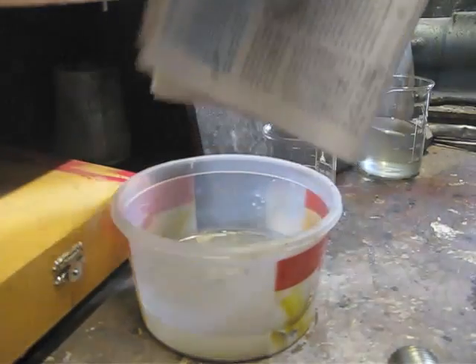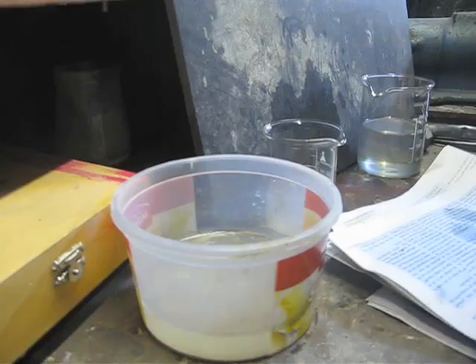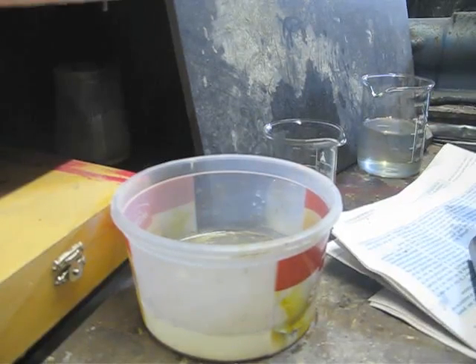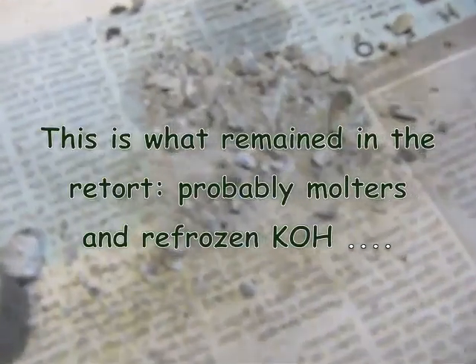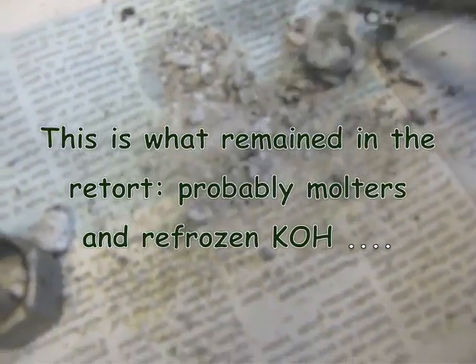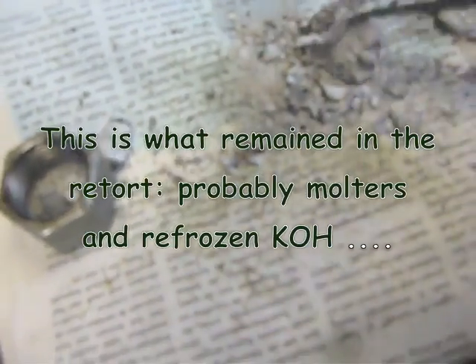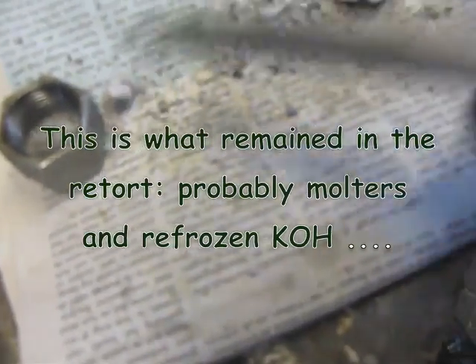There's a small debris into the water. This is similar to the sodium experiment. I don't know why, but no potassium metal is formed at all.